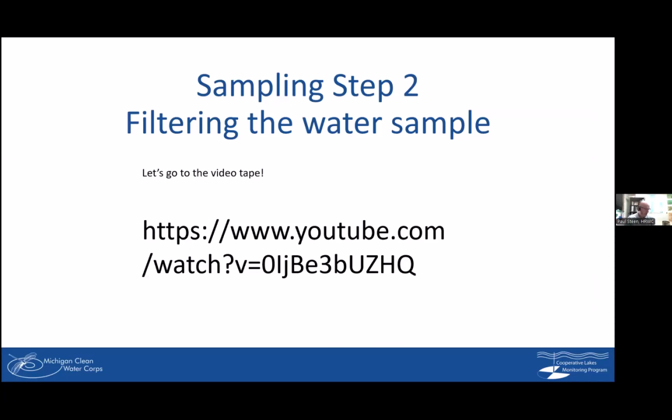Okay, so that's the part I can show you with still pictures and through video. But the next step involves taking your amber bottles and going through this procedure to put your algae cells onto filter paper. So that requires better close-ups. And to take care of this issue, we have a YouTube video, and I recommend that you maybe just take your phone or something and snag a picture of this YouTube video.